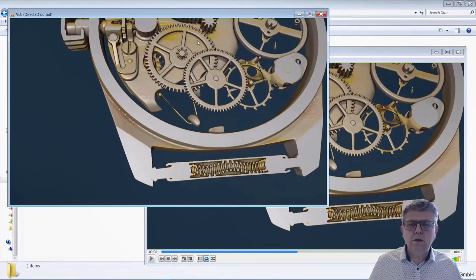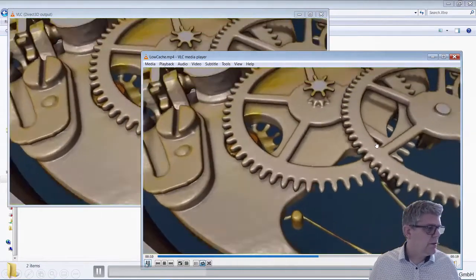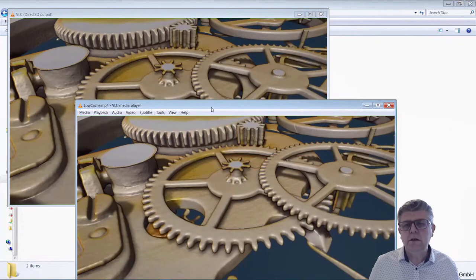So I go up to the point in which the artifacts will be visible. Here it's not yet. Yeah, you have some here. So then here you have another one. See, it's put in evidence in the video.